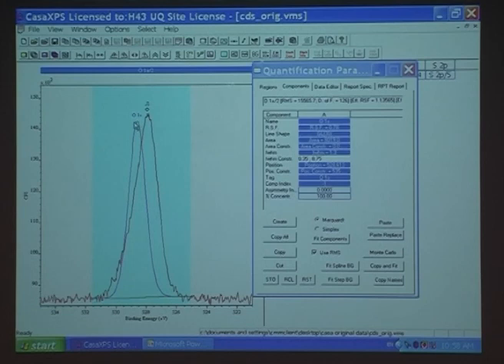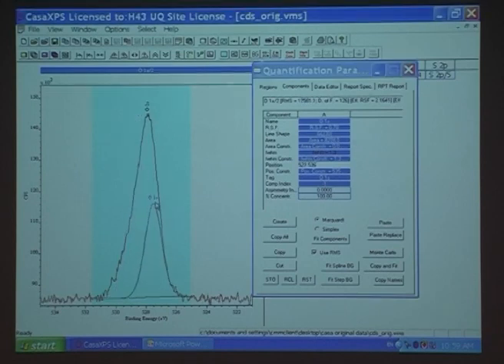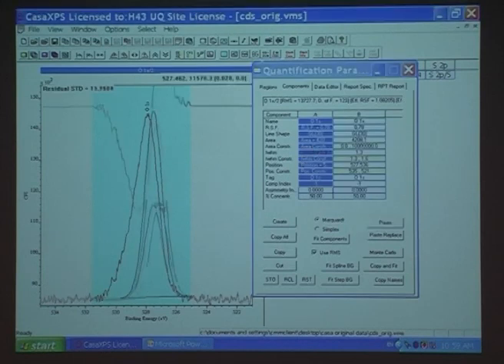This is not a polymer where it's 1.2 or very low. This is a real surface covered with some junk. I'm going to give it a little bit of freedom here by going 1.3, 1.6. That'd be the upper limit. And then I'm going to put one in here and I'm going to copy and paste. So I put another one in.